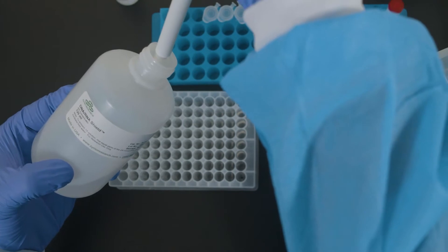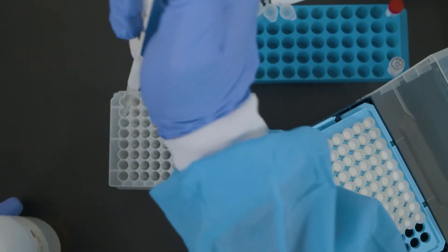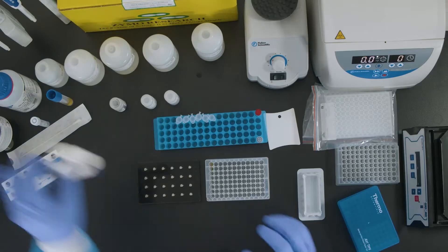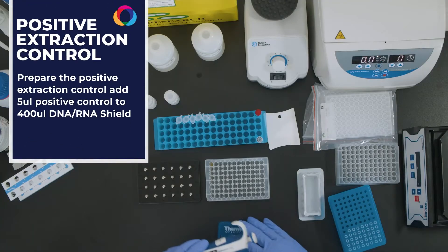The 1x DNA RNA shield is prepared from the 2x stock. To prepare the extraction control, pipette 400 microliters of 1x DNA RNA shield to a new tube or designated well on the plate. Add 5 microliters of positive control. Continue as normal.